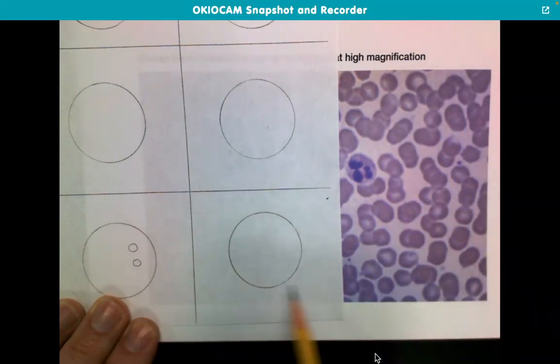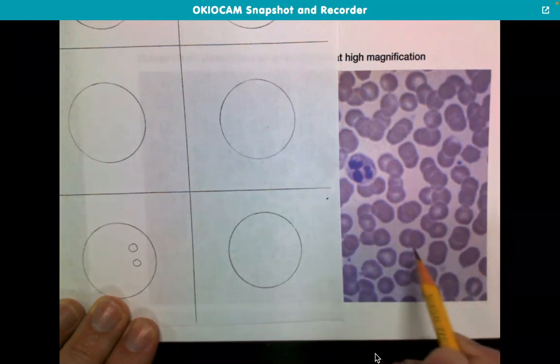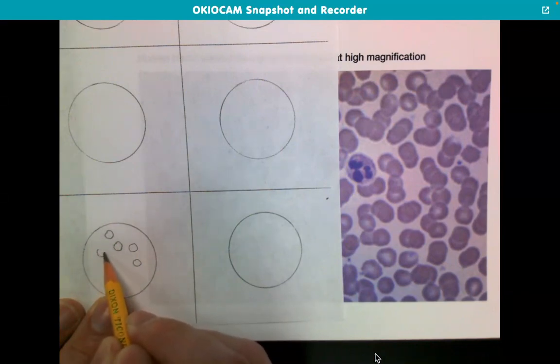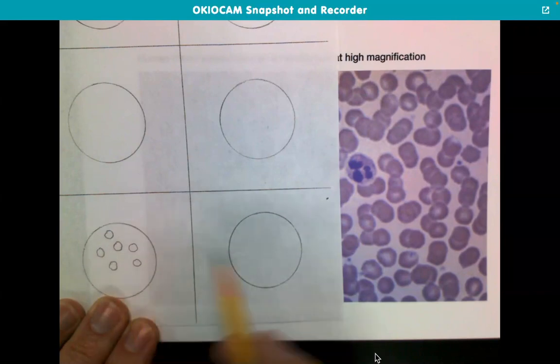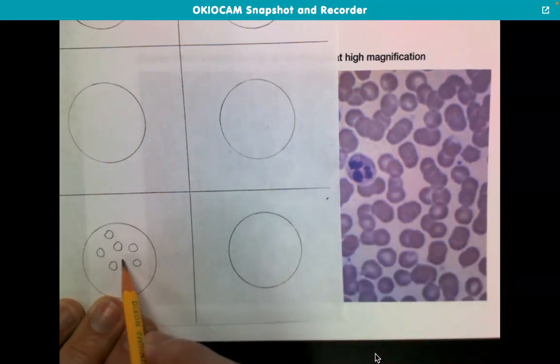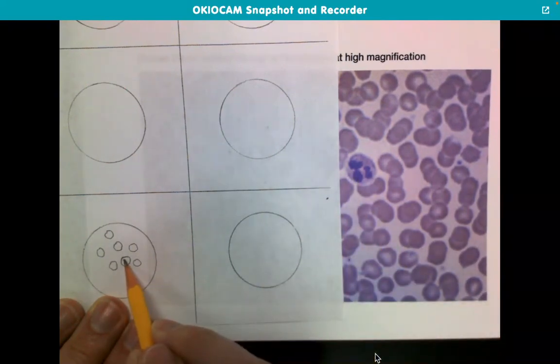And they're kind of circular, not full circles, they're a little bit jagged. So I'm just drawing some stuff here. Notice I'm not taking forever to draw it. I'm just doing a quick sketch. It's not going to be perfect. So I see those, and those are going to be my lightly shaded ones. And I got this other one here. I want to put that one in there because he looks different. So I want to add him in. So I'll just color him in with the purple spots there.